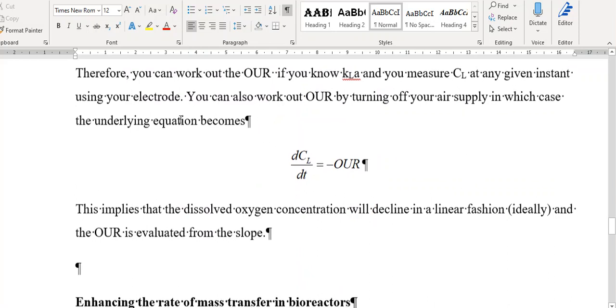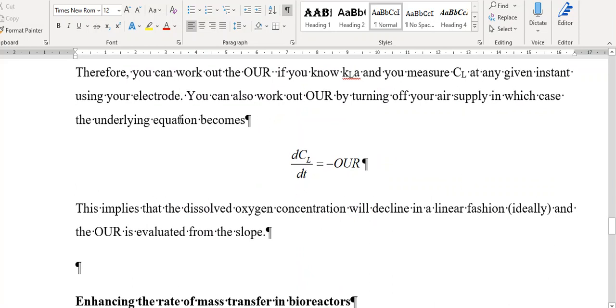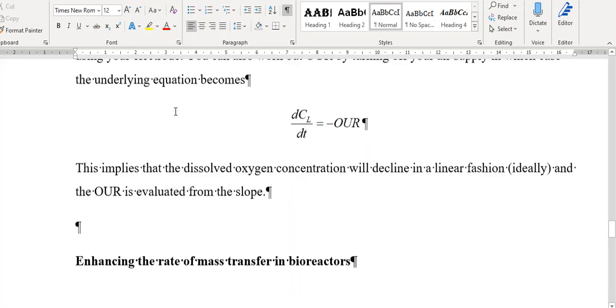So that's really a flying trip through mass transfer and bioreactors. I've deliberately kept things not mathematical in mass transfer, although I mean, not numerical in mass transfer, I should say, because as I was saying to you before, mass transfer is complicated by the fact that there are so many units you can use for concentration, whereas for temperature, it's degrees C or Kelvin, same thing really for heat transfer. But in mass transfer, you're dealing with, it could be kilograms per meter cubed, could be moles, could be molar concentration, could be a mole fraction, it could be a mass fraction, could be a percentage saturation. So I don't want you to get bogged down in numerical stuff. I just wanted you to get the basic grasp of what's going on in a bioreactor.